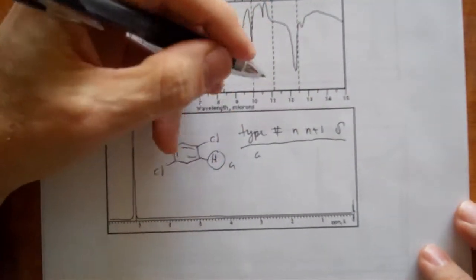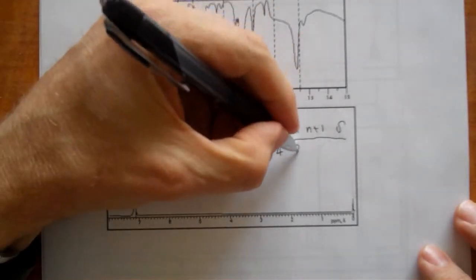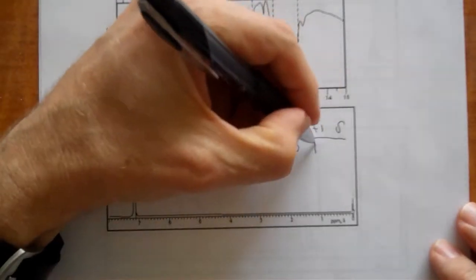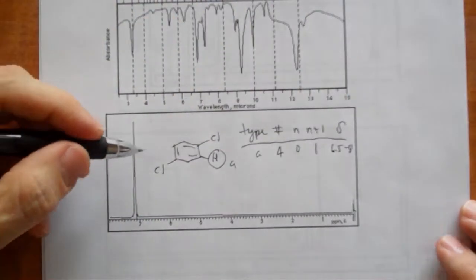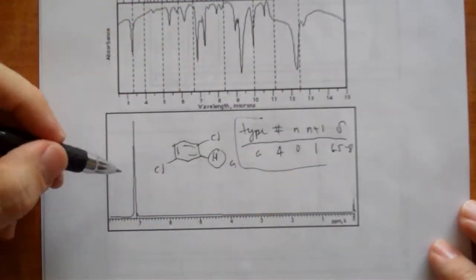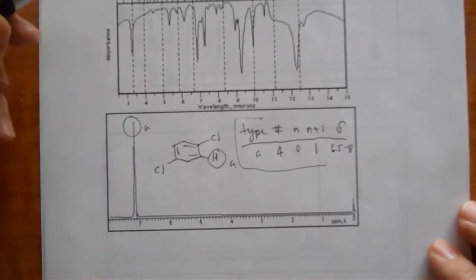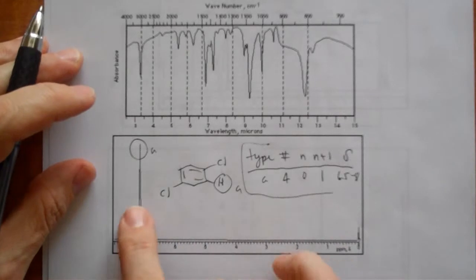Okay, type is A. The number, there are 4 of them. They have 0 non-equivalent neighbors, right? N plus 1, so it's going to be a singlet, and it's going to be between 6.5 and 8, which we clearly see that it is. Okay, so this is A, and that explains how we know that that is A.